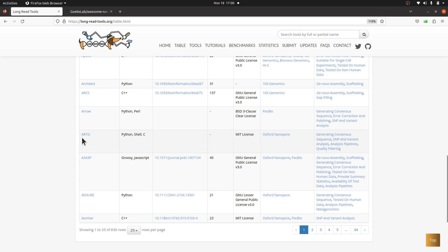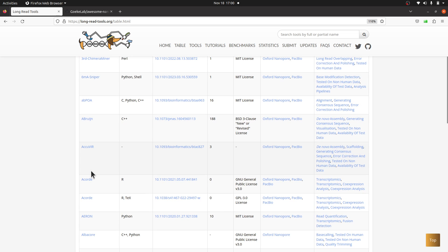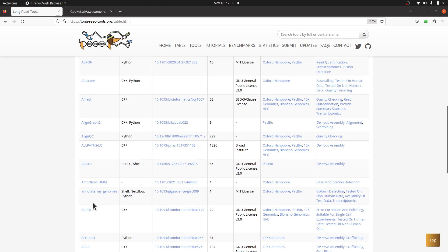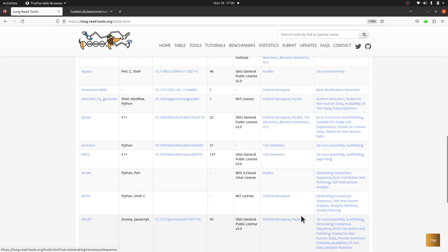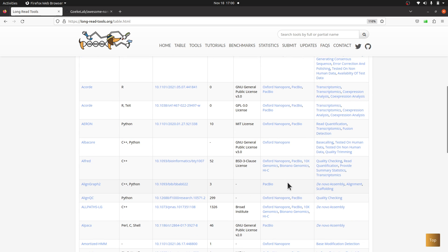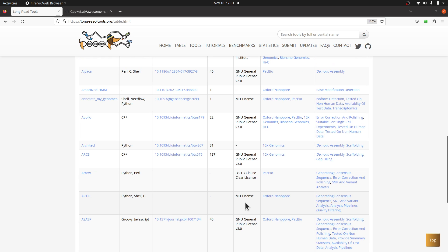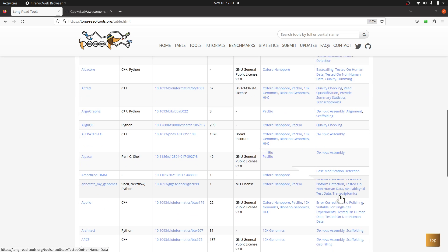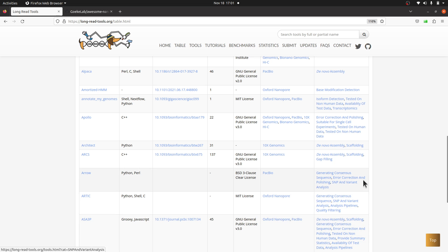If you take a look at attic, for example, the platform says Python, Shell, C. When you come to this side, technologies in focus, it says Oxford Nanopore. And then when we come to the category, what does it say? It says generating consensus sequence, SNP and variant analysis, analysis pipelines, quality filtering. So this lets you have an idea of what this tool does.